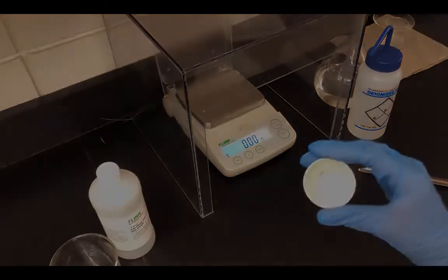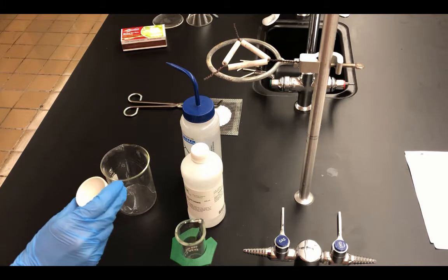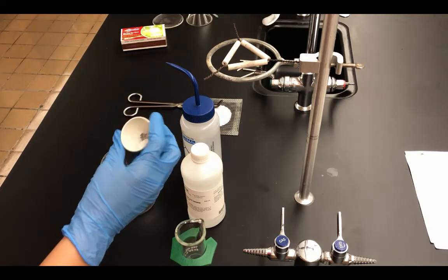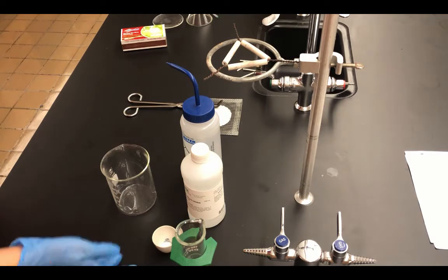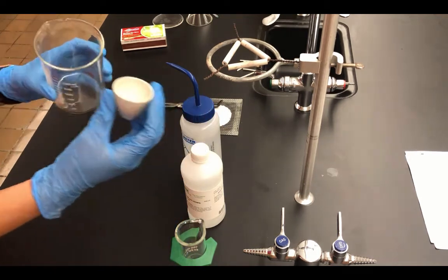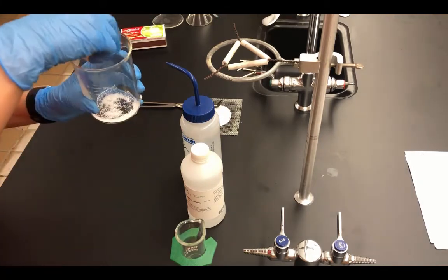So now that our unknown metal carbonate has removed all of the water, from the heating, all the water has been removed. We can now move on to the next step in the procedure, which is dissolving the metal carbonate into water. So I'm going to add the crucible contents into a clean, dry 400 milliliter beaker.